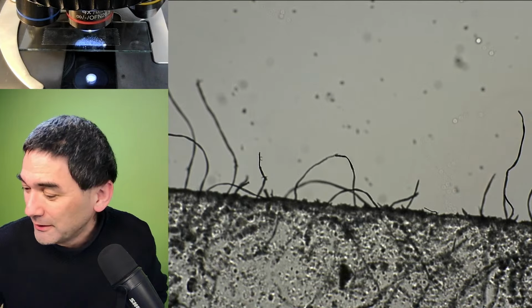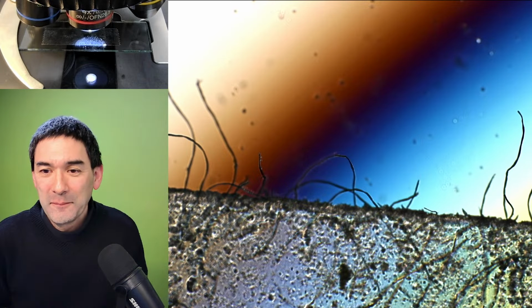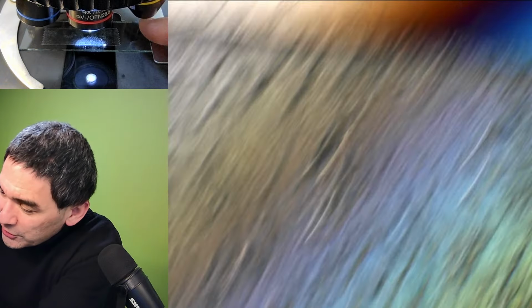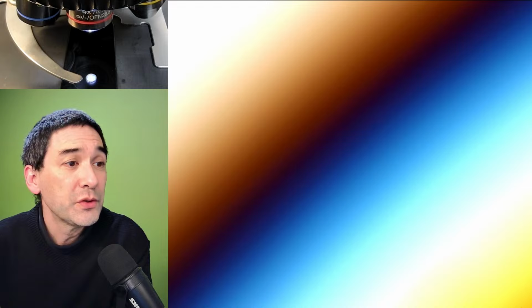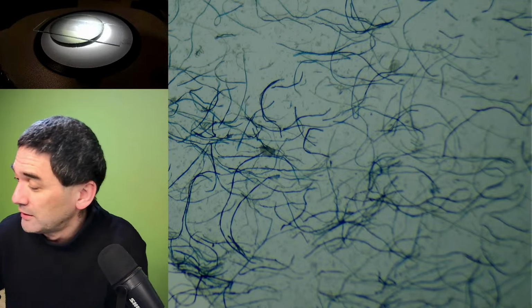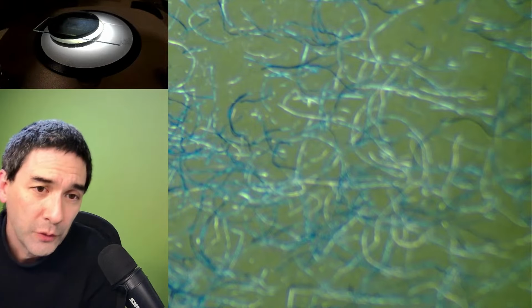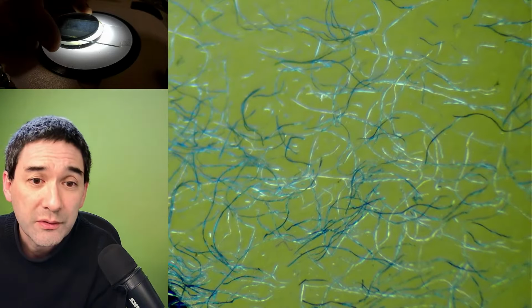But that's all, yeah. Let's add a little color because everything's so nice. Another thing that I also wanted to show you again, because I've not tried this as well. This is the stuff from my jeans. When you put it across here, you have a nice combination of color from the tape, and of course of the fibers.